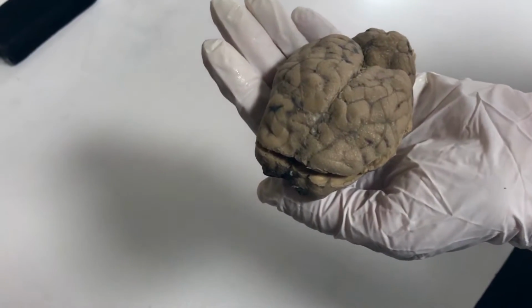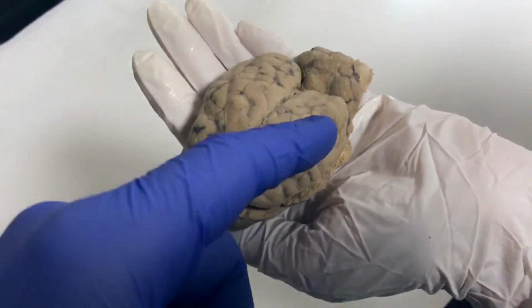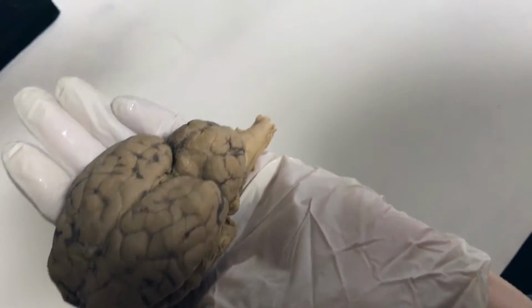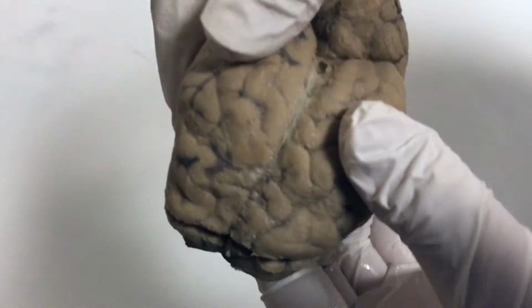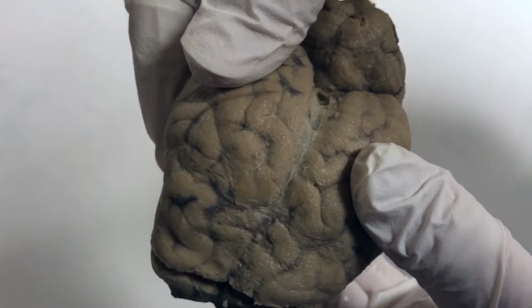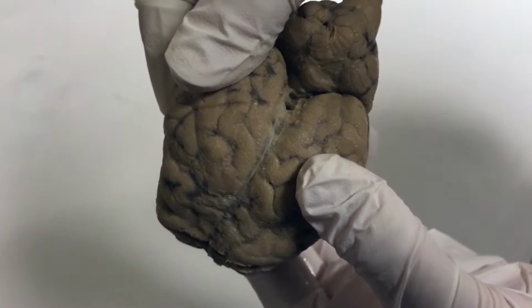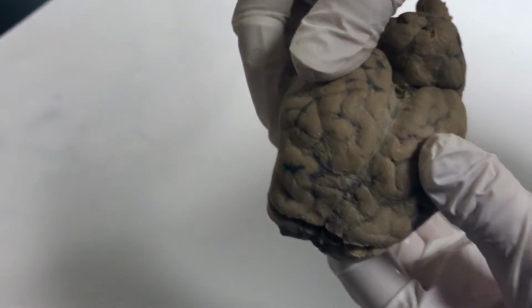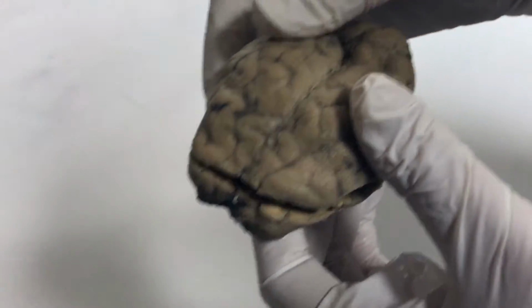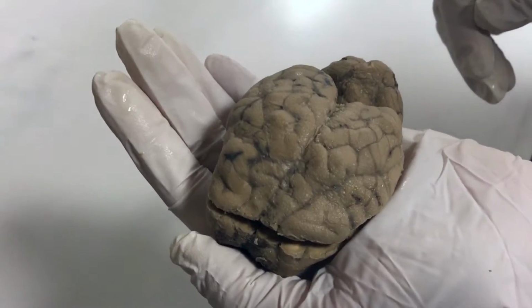So in between the cerebrum, first of all, we have the right hemisphere and the left hemisphere. Because this right here is the spinal cord, so it's the back of the animal. And now, if you look, we can actually peel open slightly the two hemispheres, and you see the longitudinal fissure, which connects the two. And there is a single corpus callosum. So it's a very colossus corpus. That is this white matter in here that connects the two. So that enables the two different sides of the cerebrum to communicate and pass information back and forth.